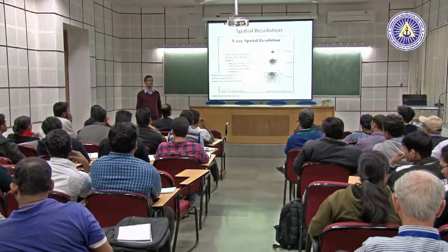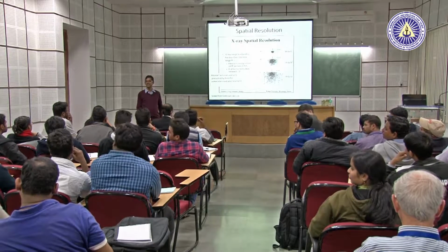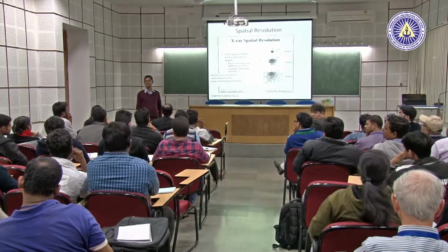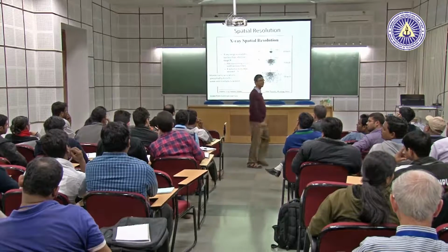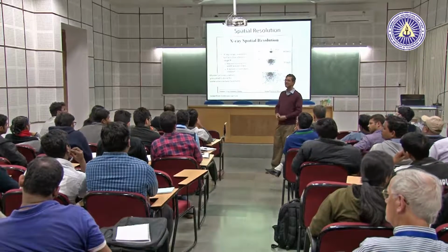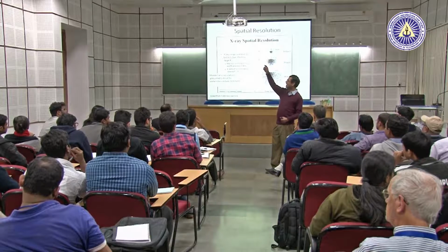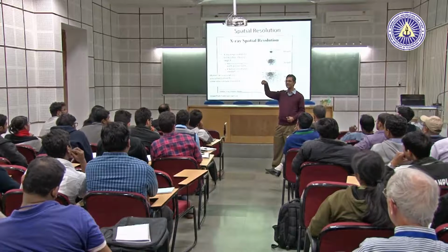Yes, any other questions? Yes. In case of EDS, you told about K alpha lines, meaning from the inner shell the electron is knocked out. Yeah. So the incoming electron will knock out the inner shell electron. Then the outer shell electron will jump to the K shell. That's why you call them K lines.